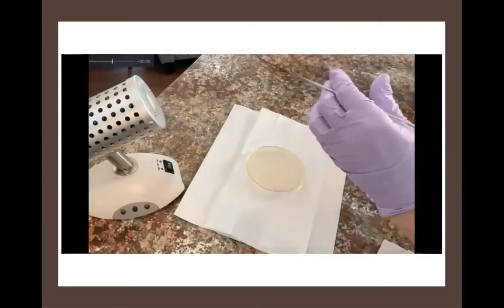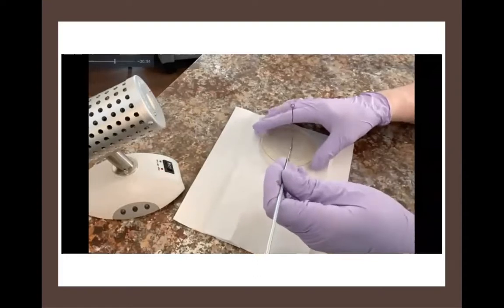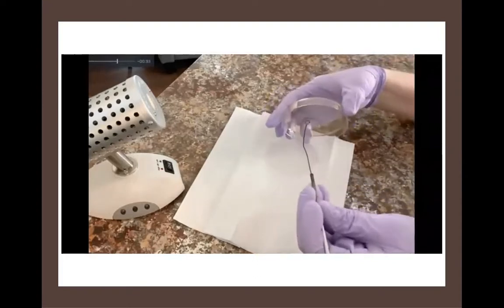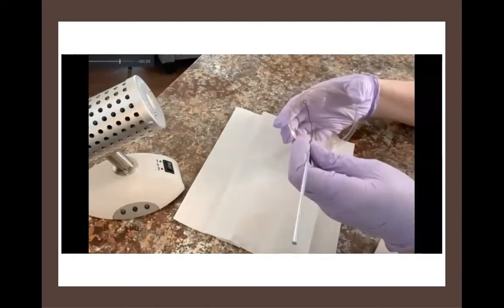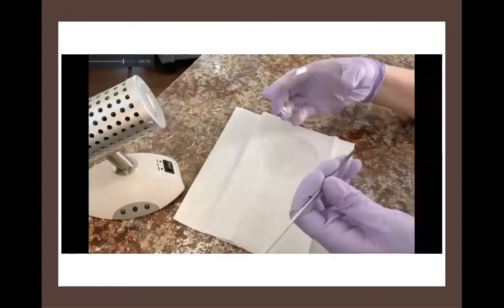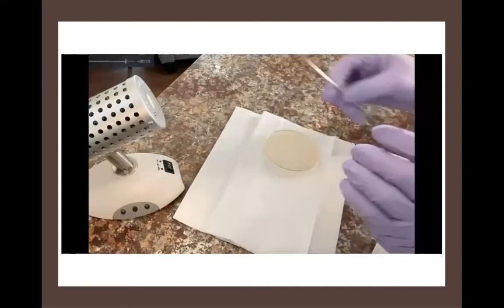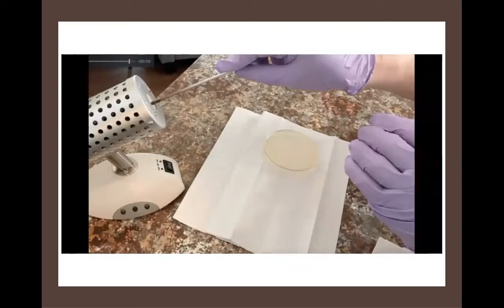Now you're ready to go. So I'm going to open this dish. Again, it's upside down. And I'm going to keep the plate at an angle so that I can put these cells on the surface. I'm going to place the loop on the surface, and I'm going to make a nice zigzaggy motion all the way across. I'm going to take my loop, remember, incinerate, sterilize, get rid of those cells.